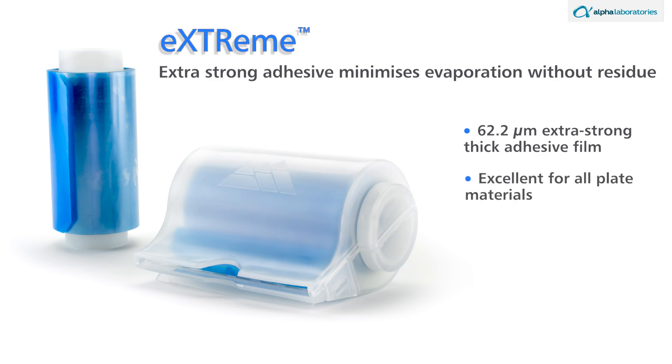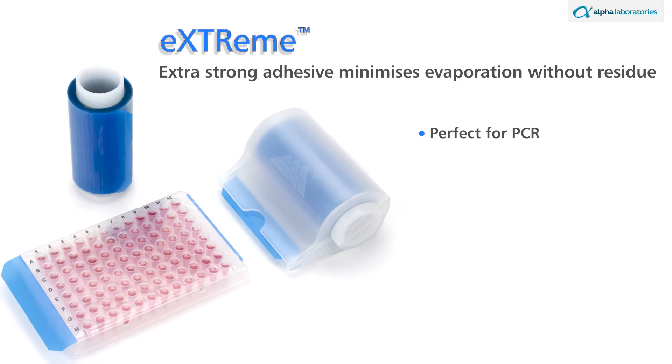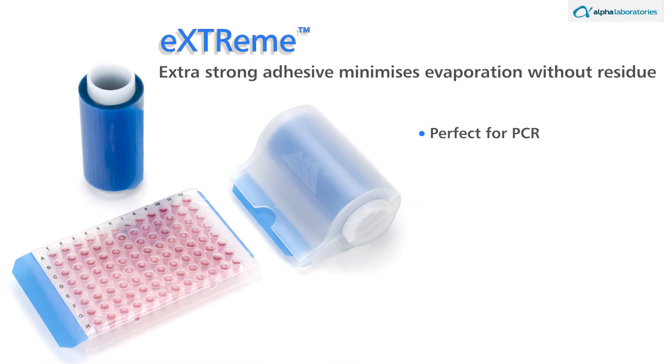Blue coded Extreme 62.2-micrometer extra strong thick adhesive film is excellent for all plate materials. The film's extra strong adhesive minimizes evaporation and removes cleanly without residue, perfect for PCR. Each film is effective from a temperature range of minus 20 to 120 degrees Celsius, and each blue coded roll covers 80 PCR plates.